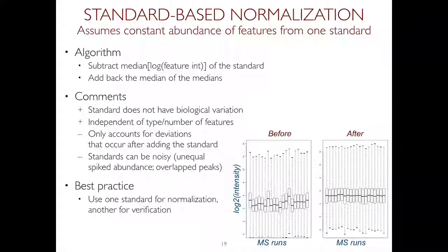What we also see increasingly is people using IRT peptides for normalization, right? But it's also silly, because I noticed that some people don't spike IRT peptides in constant concentrations, and then it's kind of lost. So if you think about this upfront, then you can actually use IRT peptides if it's done carefully.